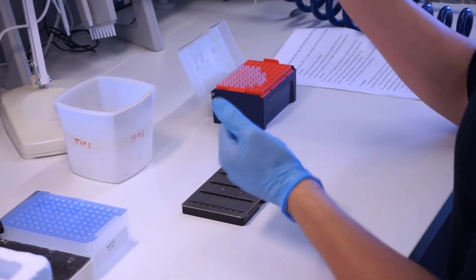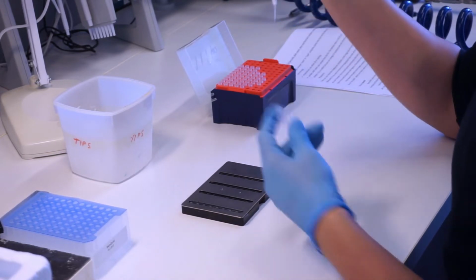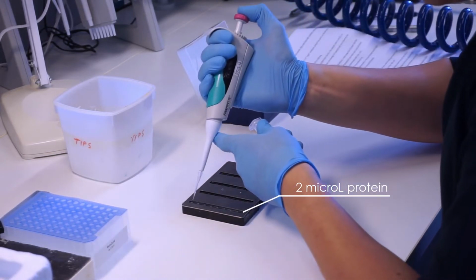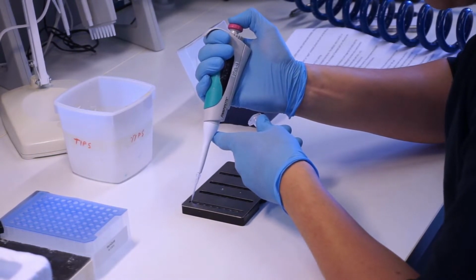Pipette 2 microliters of protein solution into the strip cups. One cup equals one row of the MRC plate. Avoid bubble formation.